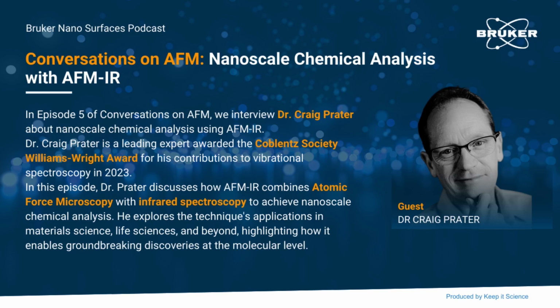Lots of applications in the life sciences, looking at proteins and cells, and there's been research into neurodegenerative diseases, looking at things like protein misfolding that are cornerstone concepts related to things like Alzheimer's disease. There's also been a lot of AFMIR done on semiconductor and 2D materials, and just a huge range of different applications. There are now thousands and thousands of publications using AFMIR. Which is always great to see.